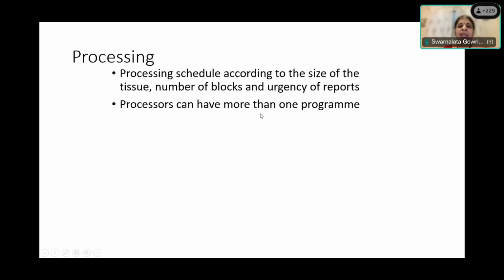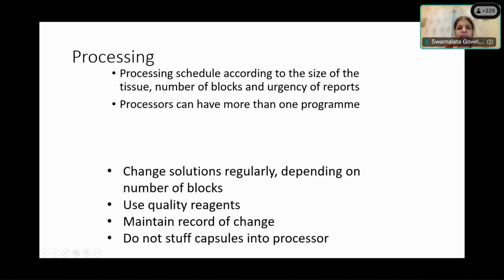the report is not so urgent. You need to take multiple blocks, larger blocks. Then we typically put all those blocks together because that is efficient use of time and solution. And you do an overnight processing so that you don't waste time. You start the processing in the evening and by 7 in the morning, it is done. And all processors have more than one program, so you can have an overnight program and a small program and so on. But in all this, we need to intervene to change solutions.